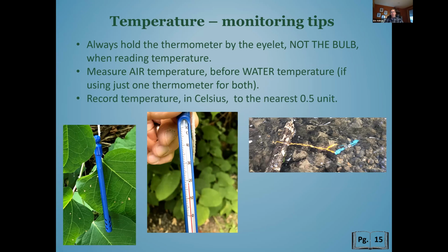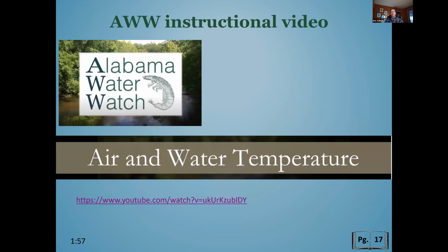And you're going to record temperature to the nearest 0.5 unit in Celsius. So what we're going to do right now is watch a demonstration video on air and water temperature.